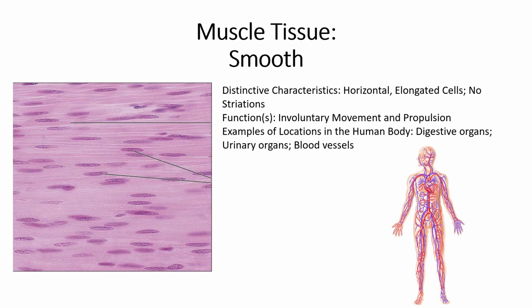And then smooth muscle. Smooth muscle, again, we said look for elongated cells, but make that distinction between the elongation of these cells and squamous cells. If you're looking at epithelial, like squamous epithelial tissue, you would see the connective tissue, right? We don't see that here. So we're looking at smooth muscle.